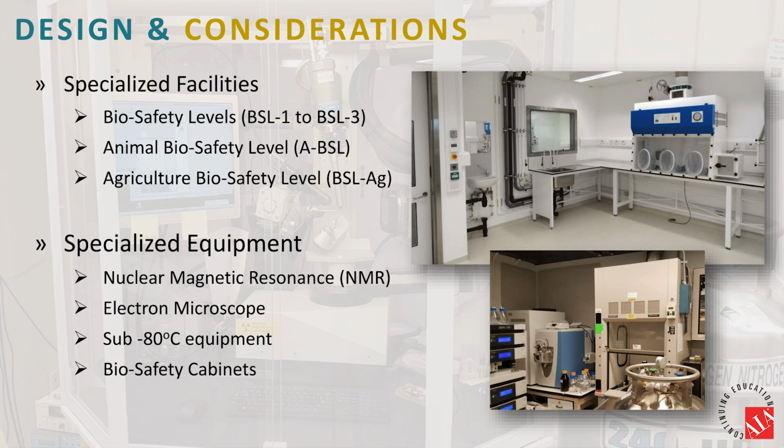So these things really build. You're coming in every year, the environmental health and safety people are coming in, they're recalibrating the fume hoods. They're not looking at the flow rings and whether they're measuring accurately. They're not taking airflow rates on things. You've got device drift and everything's going out of calibration, and after years and years of this compounding, pretty soon you're pretty far out of whack.